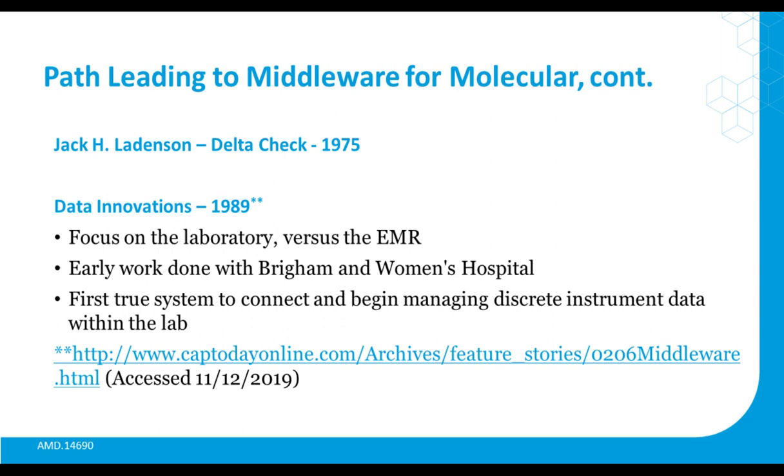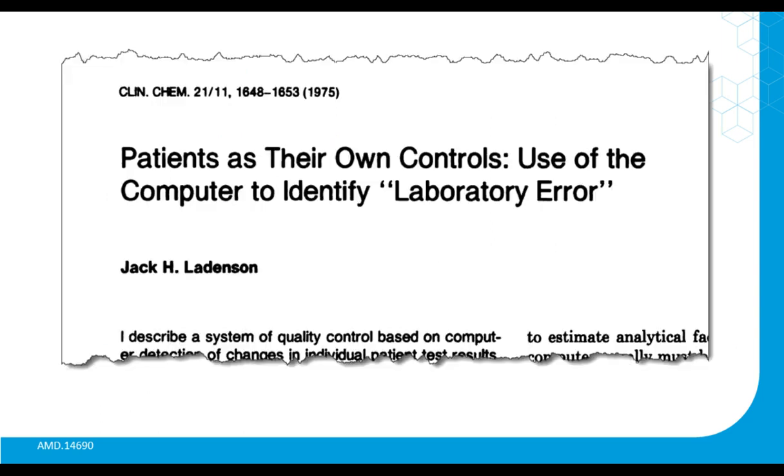1989 with a focus on the laboratory versus the EMR. It's a great company that continues to evolve and improve connectivity and insights. But this is where it began, right, folks, back in the 70s and 80s. And they were the first true system to connect and really begin managing discrete instrument data from within the laboratory.